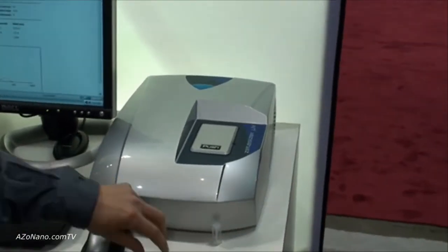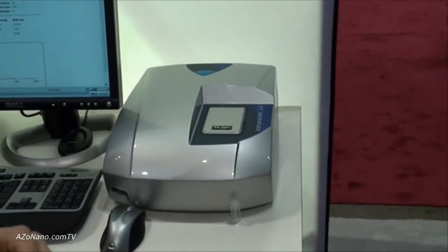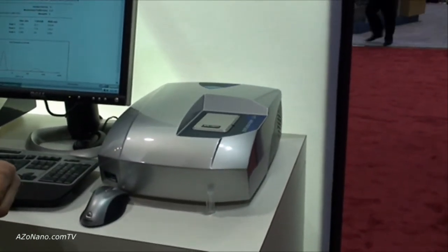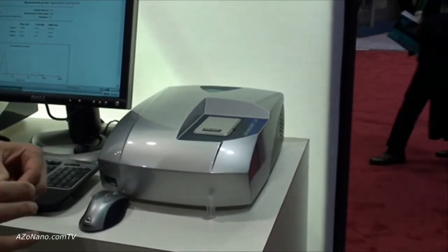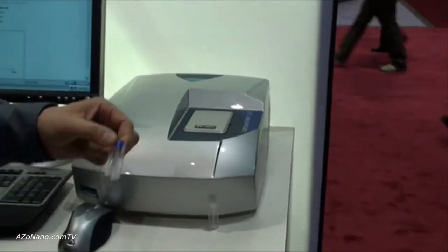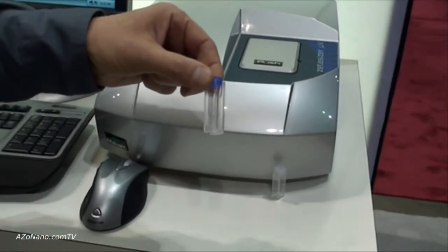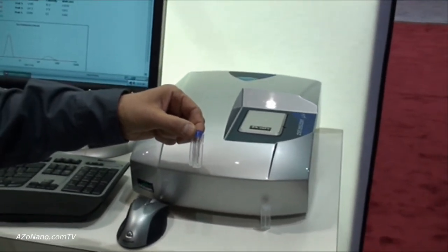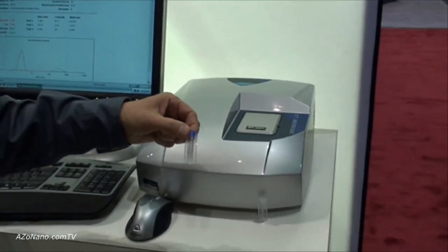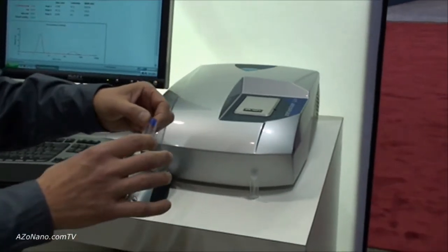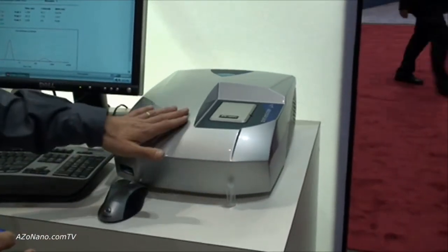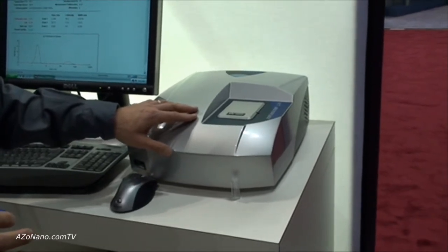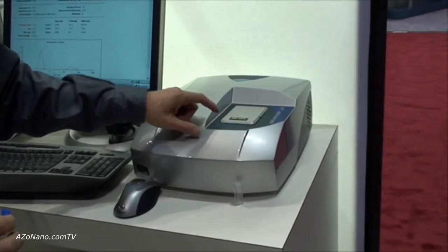It's a dedicated batch dynamic light scattering instrument that has the ultimate in sensitivity and low sample volume requirement. The lowest volume required for this instrument is 2 microliters. This instrument is geared in the submicron range for a broad variety of nanoparticles and protein applications.